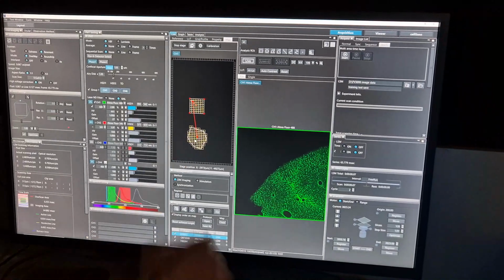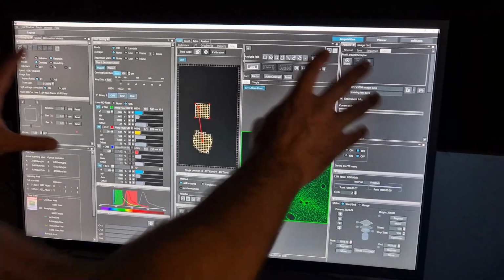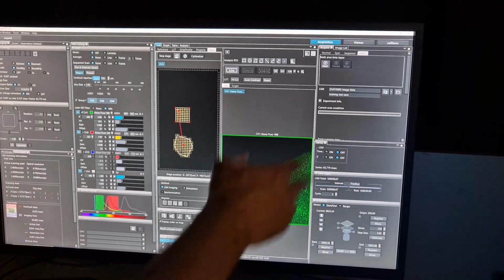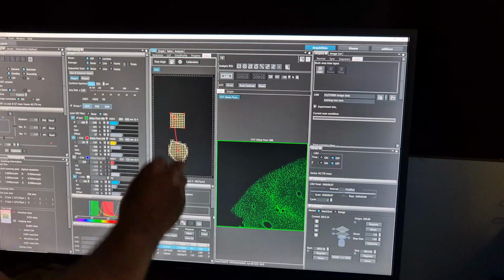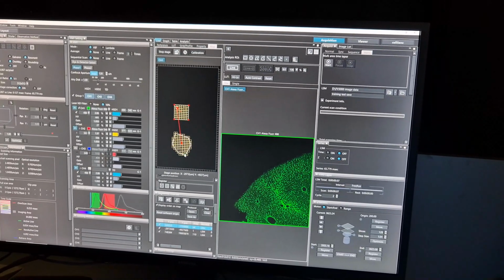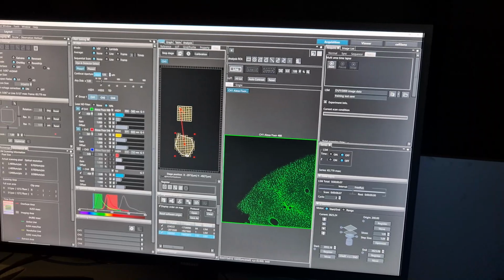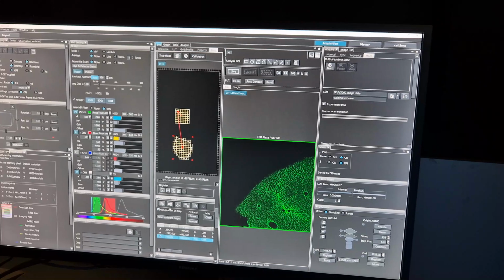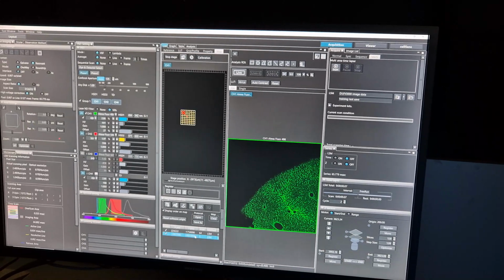Okay. So each time you do this, it takes all of the settings that you currently have set. It could be the objective, it could be the scan area, it could be the detector, it could be these things, and it allocates it to that registered area. So you need to be careful of that. If you ever make some changes, which I did, you need to update those changes to the registered area, otherwise you're going to be potentially using the wrong settings.